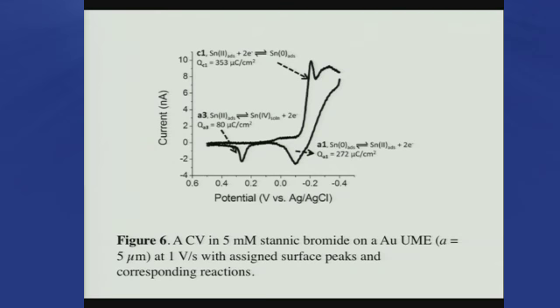However, if you look more closely at faster scan rates, so now I'm at a faster scan rate than the one I showed before, the waves are not so nice and clean anymore. And if you look at these, you see all of a sudden this funny guy has popped up here on the reduction side. And if I scan faster and faster, this is going to be bigger and bigger. And there's this very sharp wave that's popped up here.